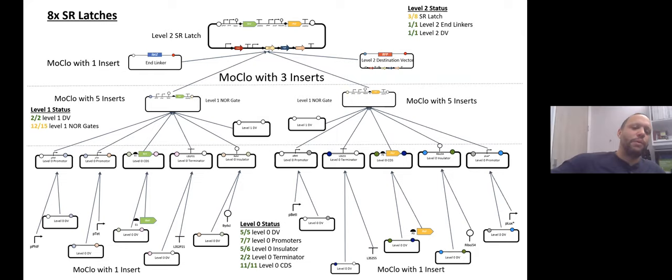And then what we also do is transfer some of these, the actual execution of these circuits, to executing in microfluidic environments, which is a whole other talk, but we're making them amenable to be done traditionally when plated, but also in microfluidic environments.